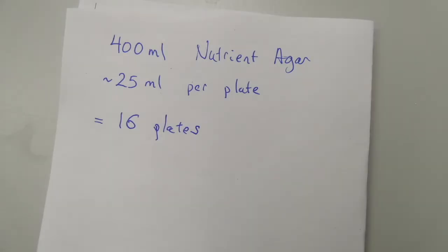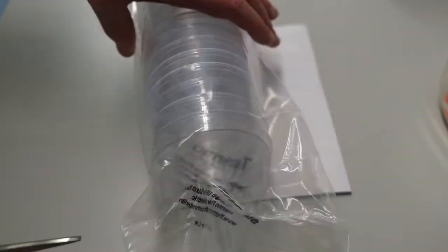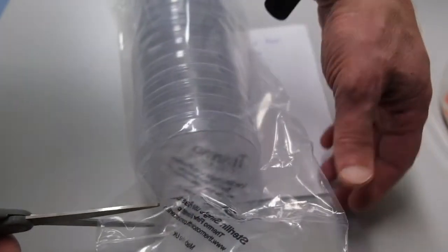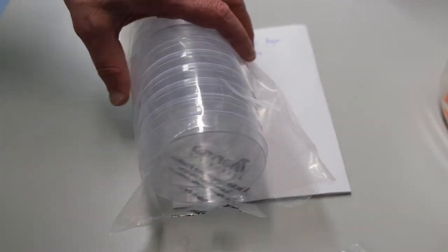With a 400ml bottle of nutrient agar, we can make about 16 plates. Plastic petri dishes come sterile in a plastic bag. We'll get 16 of them out of the bag.